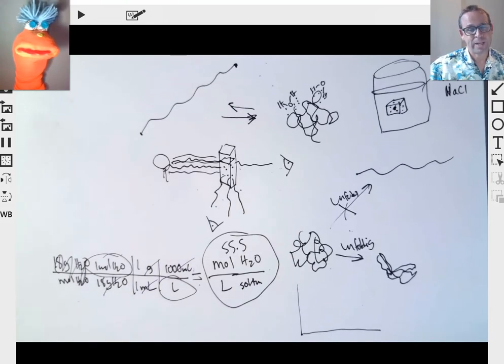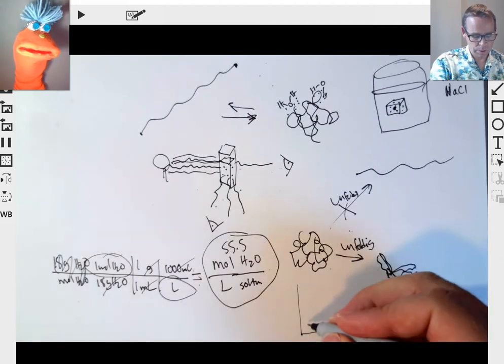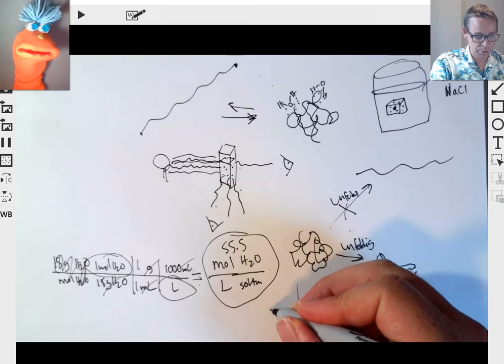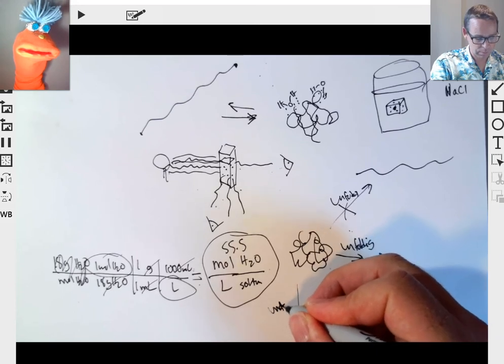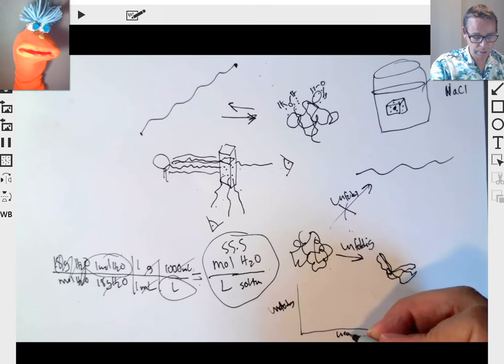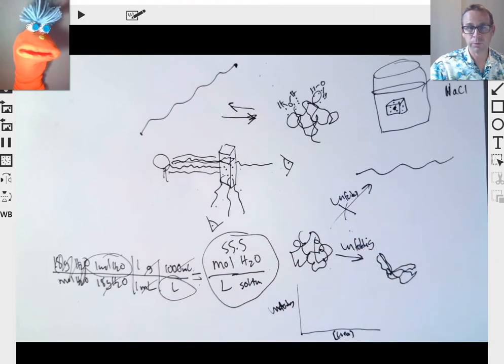So now, protein unfolding is kind of catastrophic, we say. Or in other words, if I have a measurement to predict unfolding, as I make my perturbation, whatever my unknown is, maybe it's going to be concentration of urea, right? A chemical unfolding. This can be temperature. There's a variety of different ways that you can perform the unfolding.